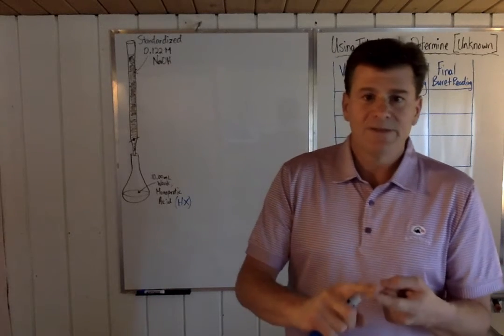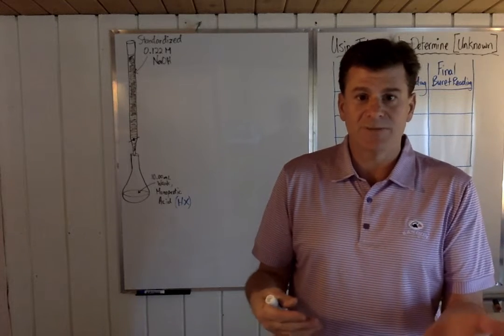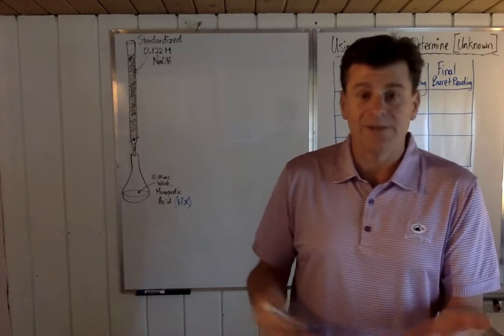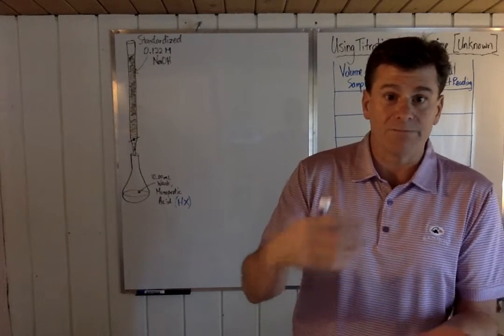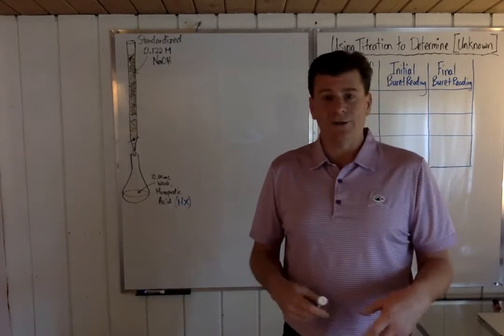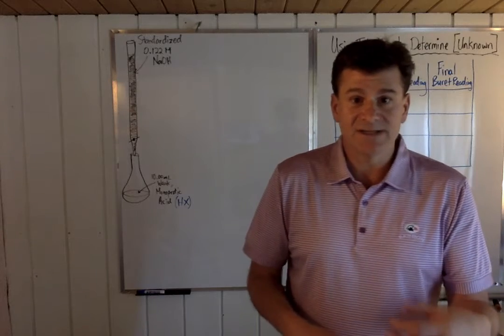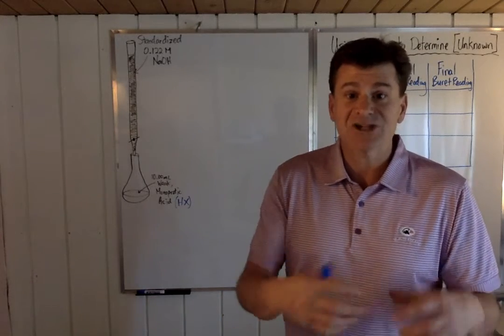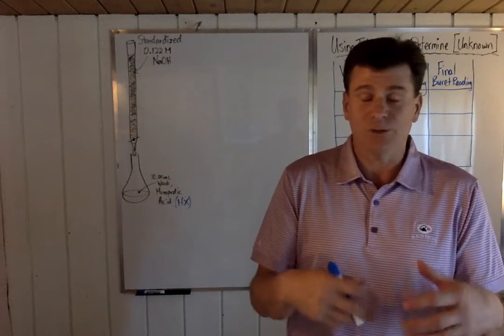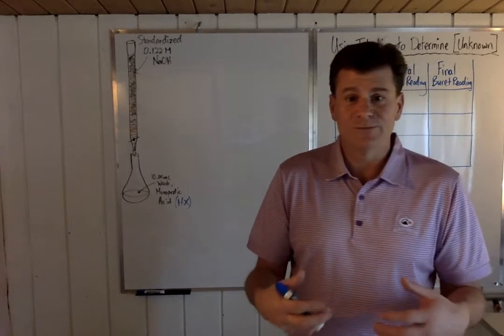Number one, the mass is going up on the scale. It'll just sit there, and magically the sodium hydroxide will just be sitting there on the scale. You're not touching it or anything, and its mass is going up. That's because it's absorbing water from the air, and so it's going up in mass because it's got water attached to it. The second thing you're going to notice is it's going to start to glisten. It absorbs so much water that the surface of the little sodium hydroxide pellet will actually start to dissolve in that little bit of moisture it starts to absorb.